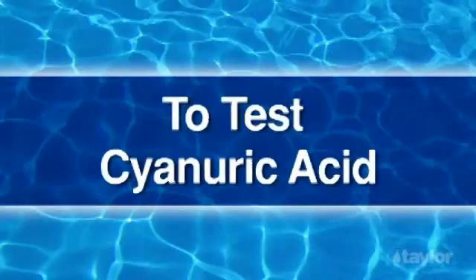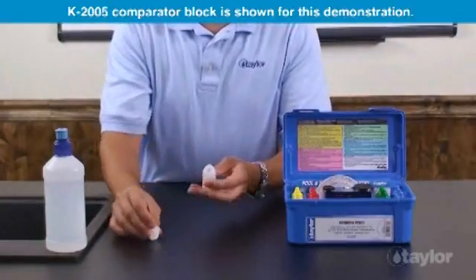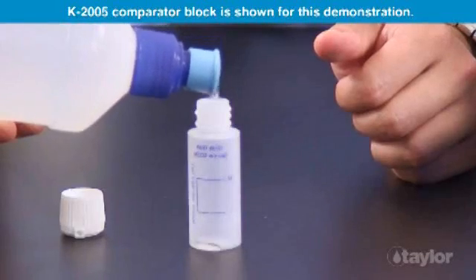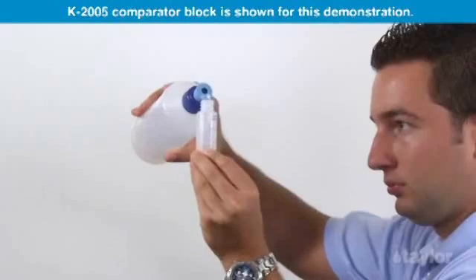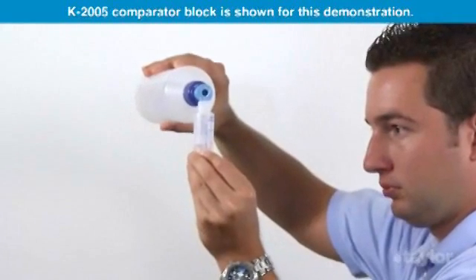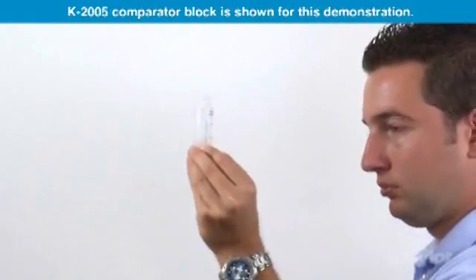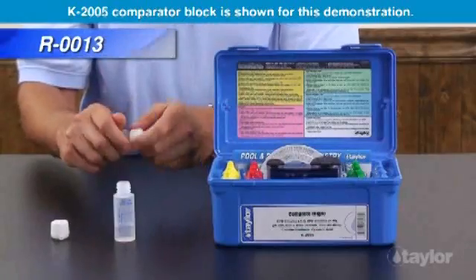To test cyanuric acid, rinse and fill the CYA dispensing bottle, number 9191, to the 7ml mark with the water to be tested. Add reagent 13 to the 14ml mark.